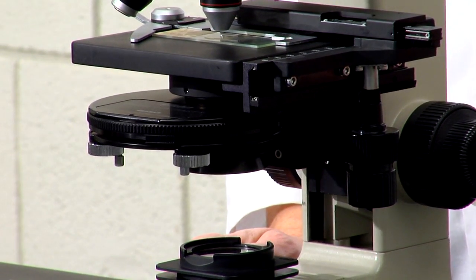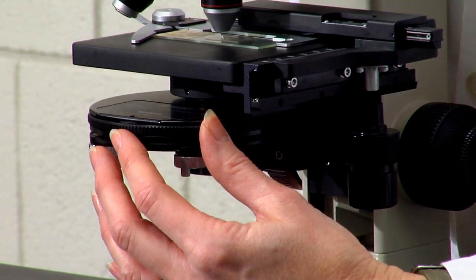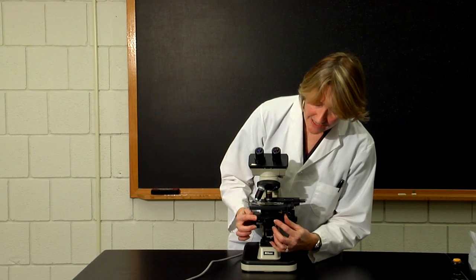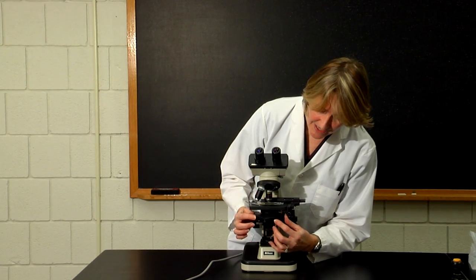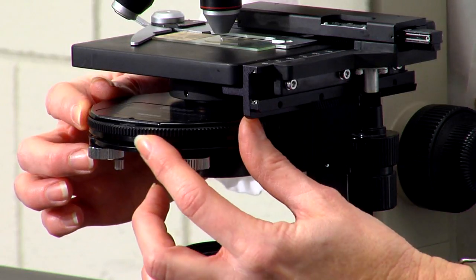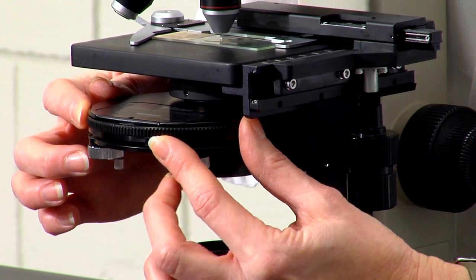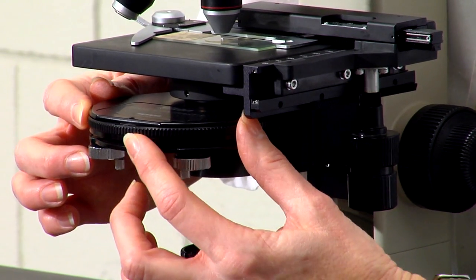The iris diaphragm is on the front of the rotating disc of the condenser lens system. It is a little slider, and as you open and close it, more or less light will be allowed to shine onto the object.